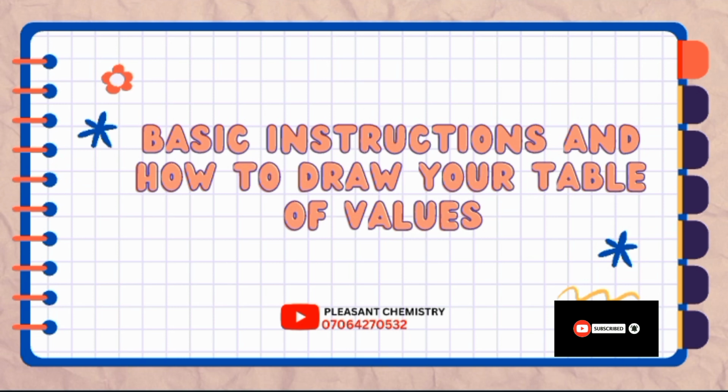Basic instructions and how to draw your tables of value. Now, like I said earlier, this class is to tell us the basic instructions, the basic errors that students commit while forming their tables of values during titration. So I'll be using cases to identify the errors that students commit. So let's go.